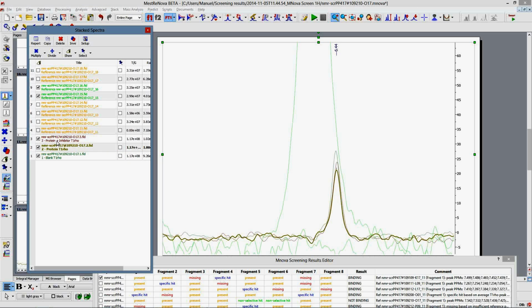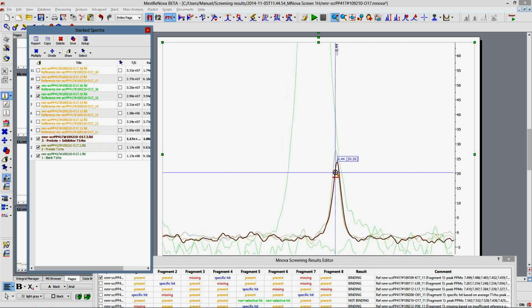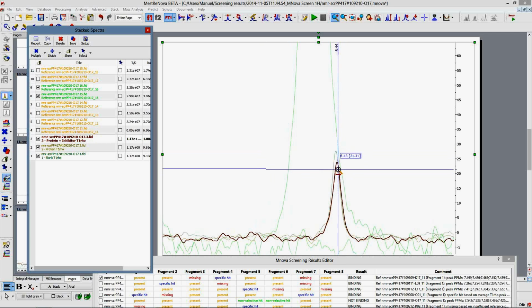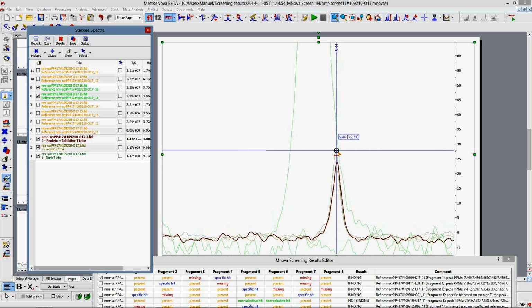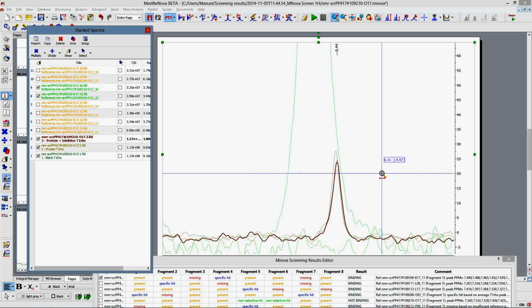And then I see attenuation with my protein, but then it doesn't fully recover. Remember, when I said this, it needs to recover over 25% of the intensity of our protein, of our scout signal, in order to be considered as having fully recovered. Otherwise, we are going to be labeling it as a non-selective hit.